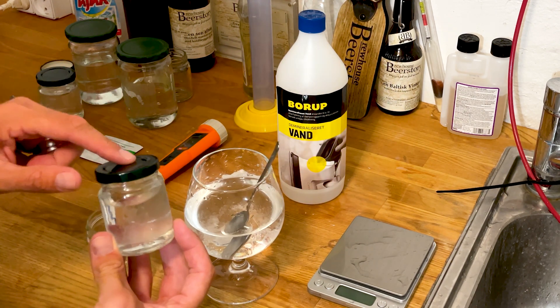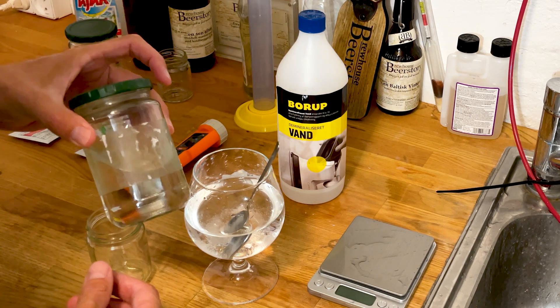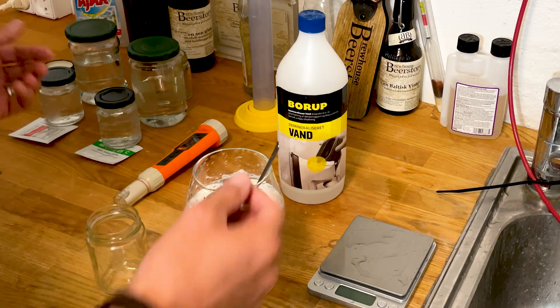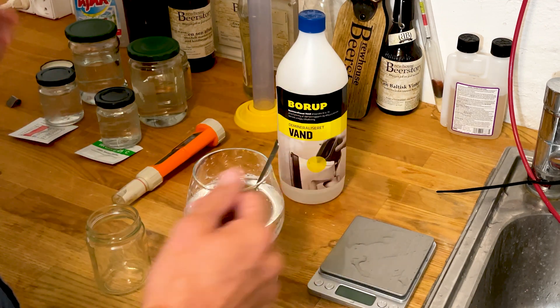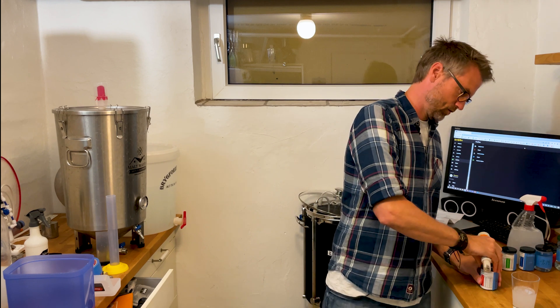I call this my calibration glass. I write on here what's in there, and this is the backup. This can hold forever, so I probably don't need to buy more of these for the next few years. When it's mixed you can use it for a very long time.